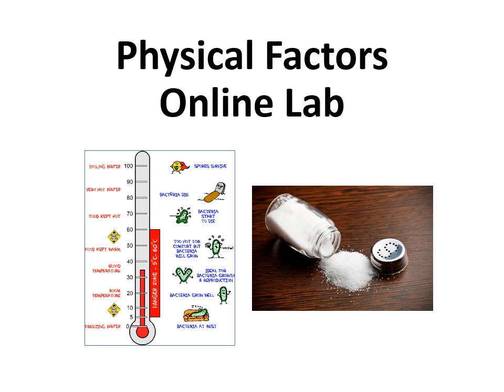The physical factors online lab. Specifically, we mean the physical factors that can affect the growth of microbes. So in our case, we're looking at bacteria.